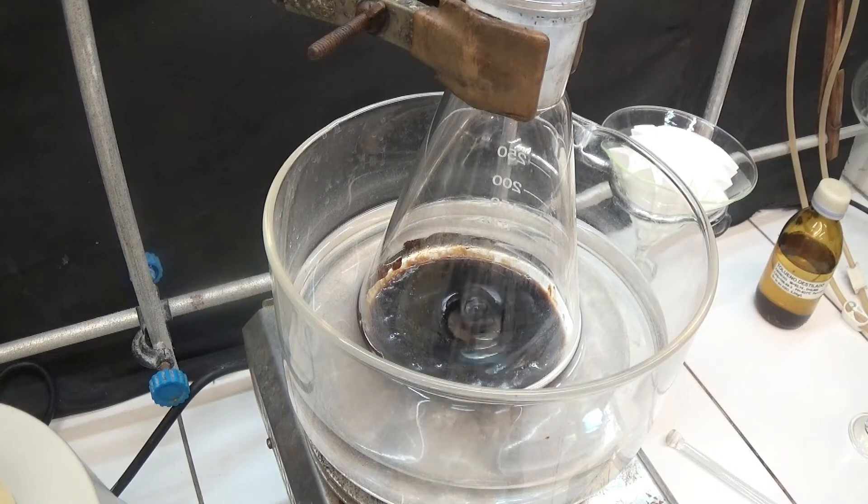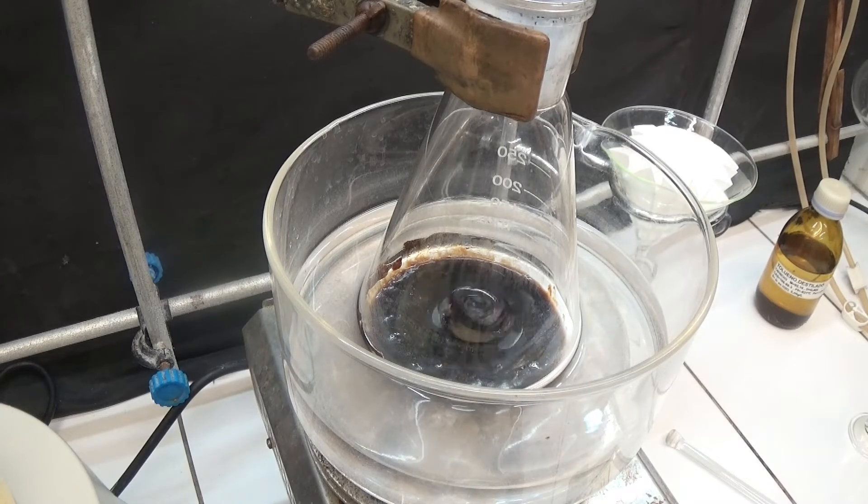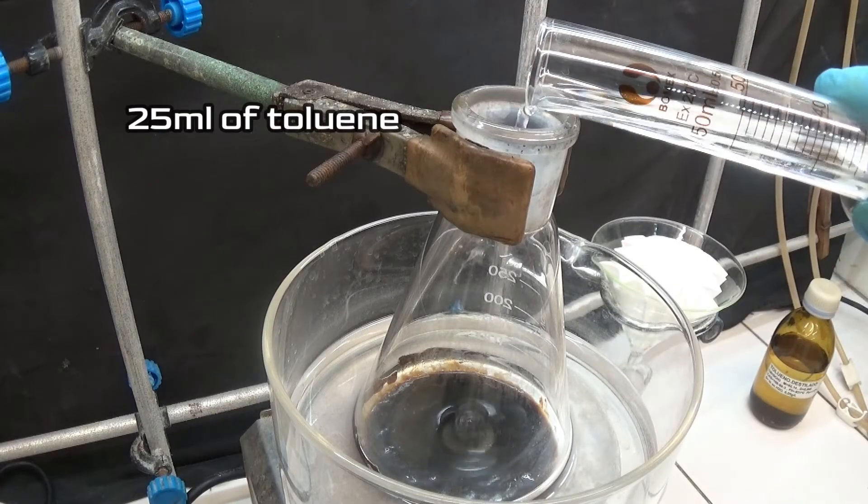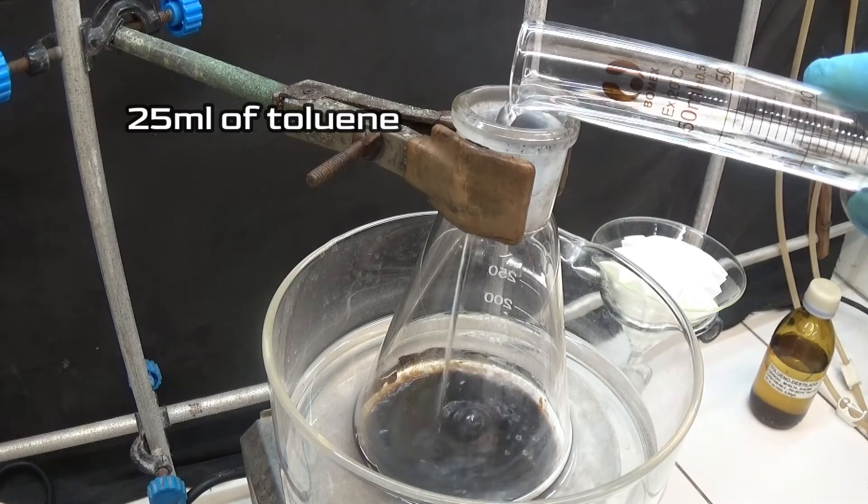Once all the water has evaporated, a dark residue remains in the flask. Add 25 milliliters of toluene and we will eliminate all the water with a Dean-Stark.